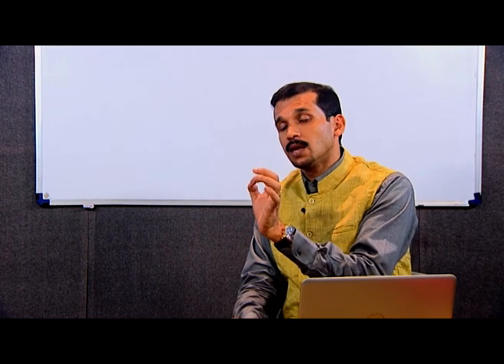And the fourth point would be the identification of fine grained minerals. The minerals are very much being explored with the help of XRD, because as you know, the minerals are mainly made up of high atomic number elements.